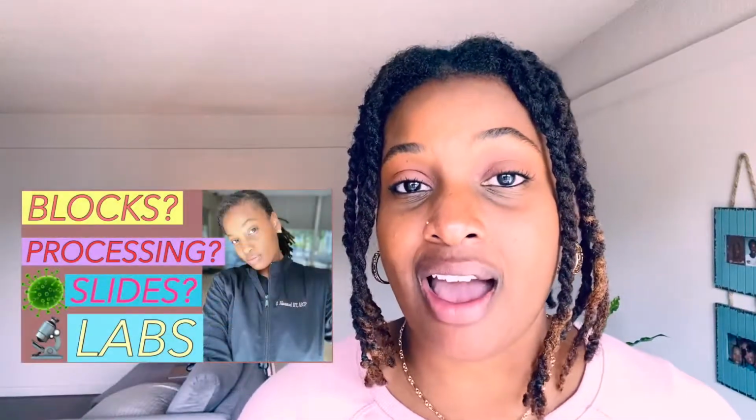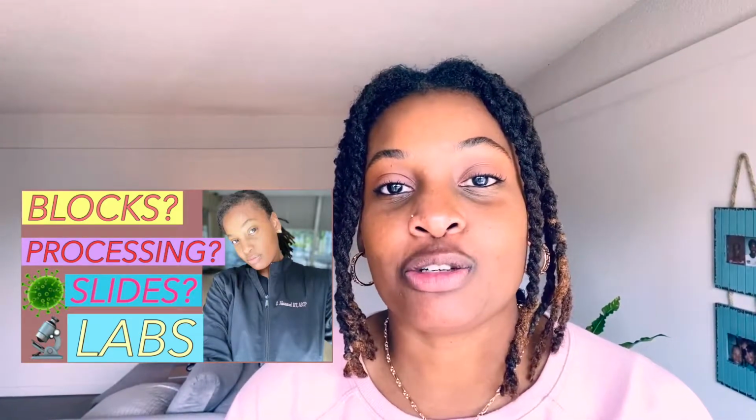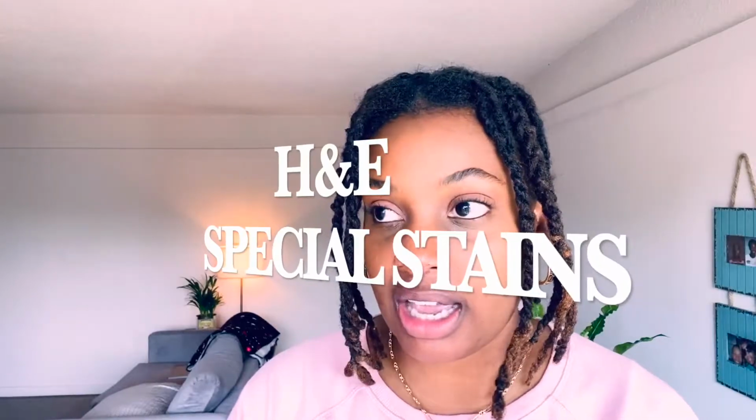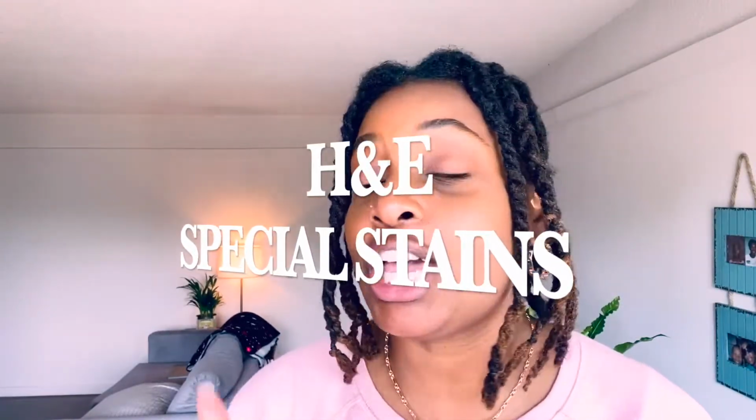All labs are not automated. Being automated will be amazing. It makes your life 1000% easier. I've come from a lab where I had to do everything manually, including H&E stains, special stains, immunos, and cover slipping. So be prepared, if you get into a lab, that everything will not always be automated.